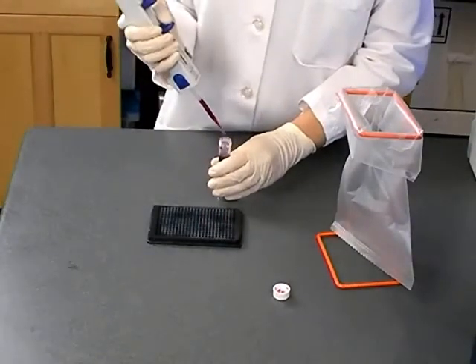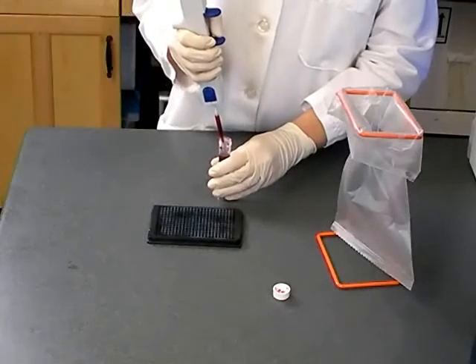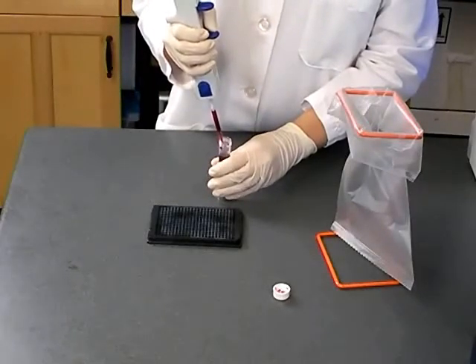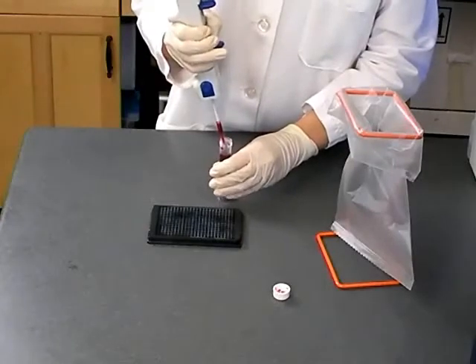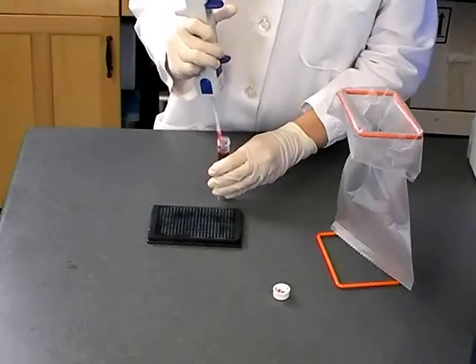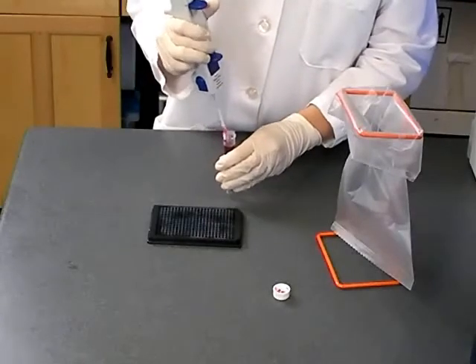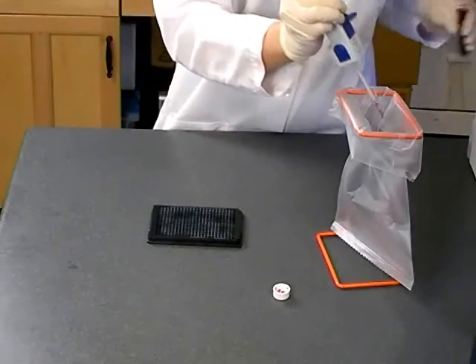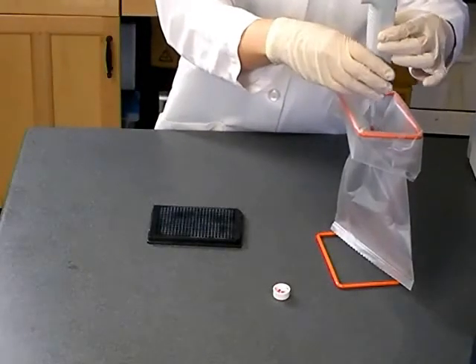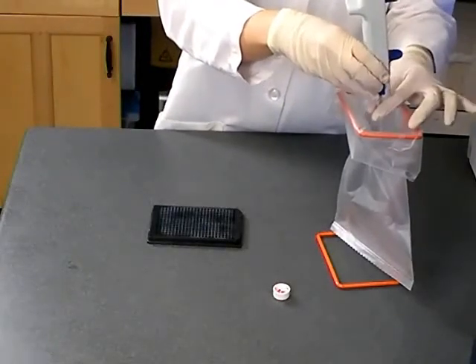To discard the pipette tip, first dispense any remaining blood back into the source vial or waste container by pushing down on the filling lever. It is very important to discard remaining blood in the pipette tip before removing the tip to avoid contamination. Hold the tip over the waste container and press the blue buttons to release the tip into the container.